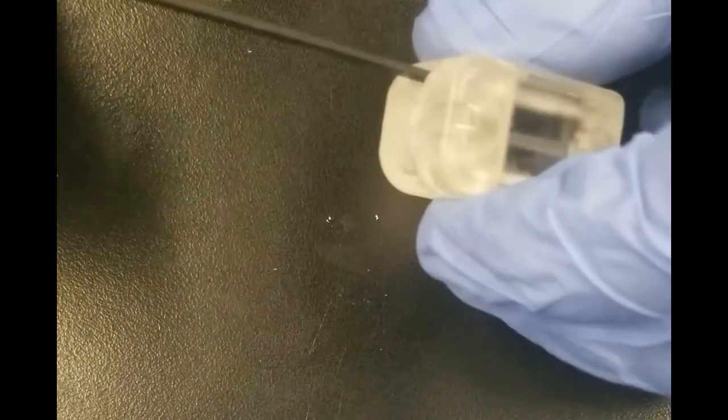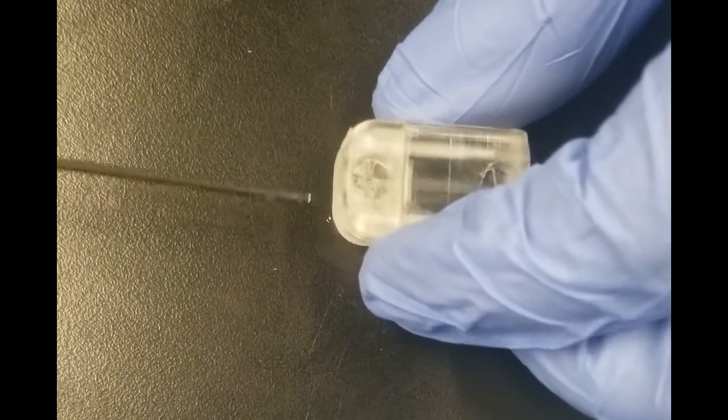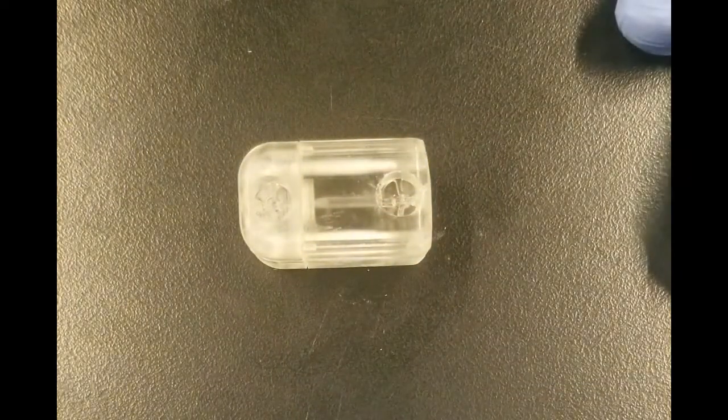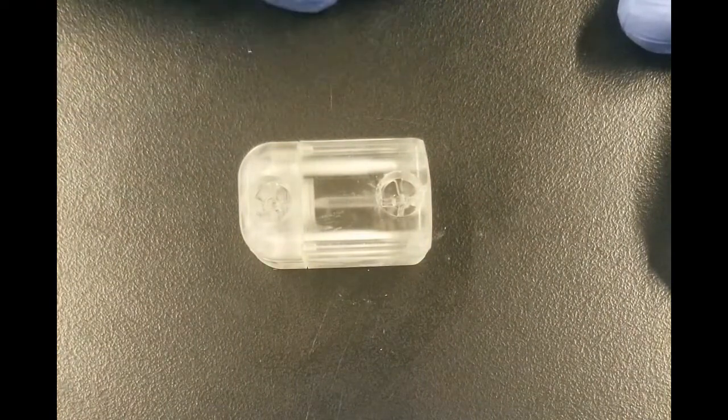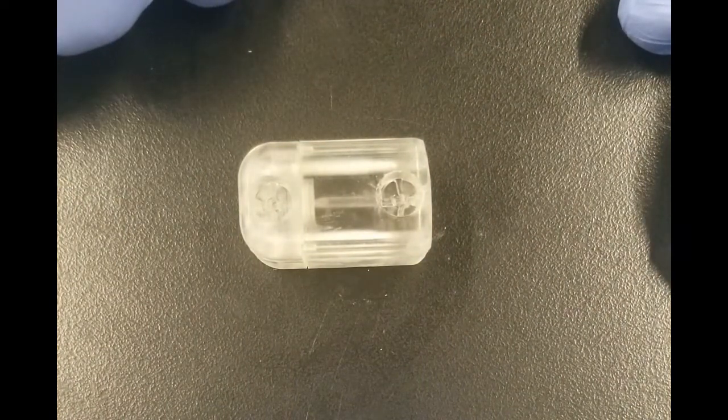I'll continue to screw the screws in until I feel the screws are snug, and then assembly is complete. It is worth noting that you don't want to over tighten the screws as that may lead to damage to the chip.